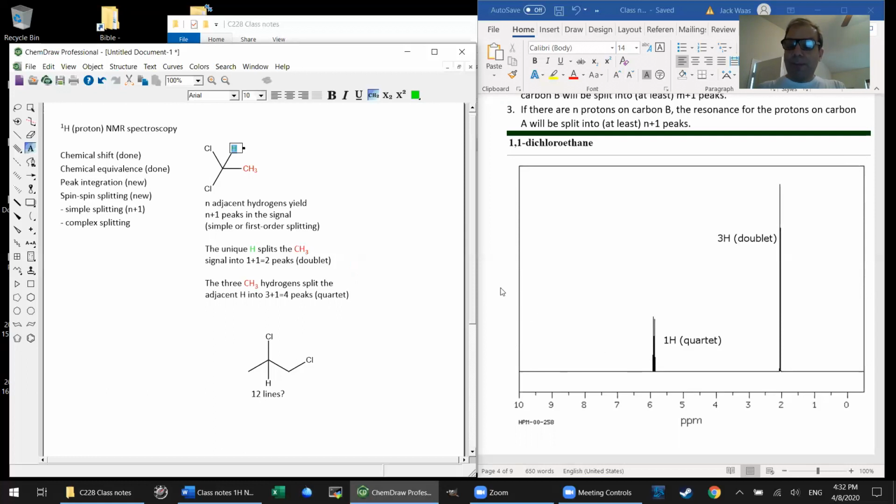And it might be a little bit hard to see, but if you stare at it, I think you can see that there are 4 lines here. Shorter, taller, taller, shorter. Oh, and we could go into the reason why the peaks are the different heights that they are. That arises out of something you probably looked at in high school math known as Pascal's triangle. And that will help you predict what the relative heights will be, at least pretty close to that. But again, I want to keep this as practical and of immediate usefulness as I possibly can.